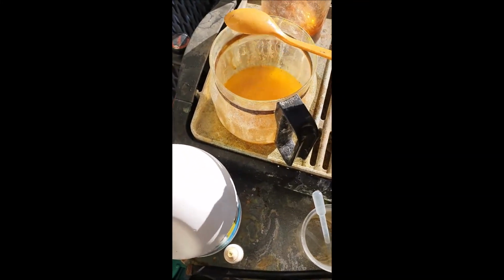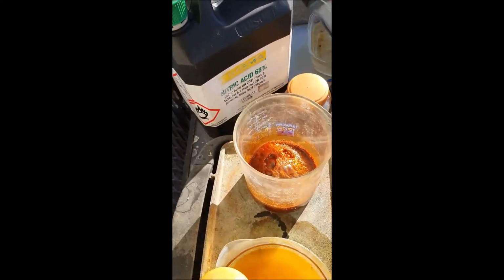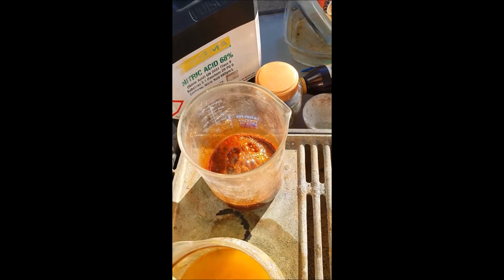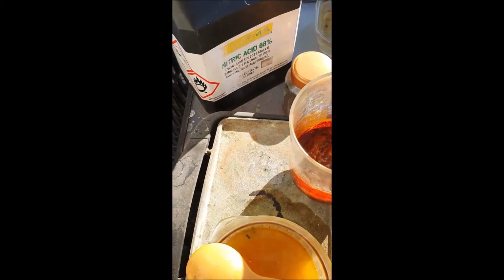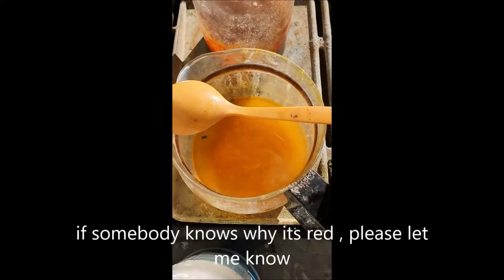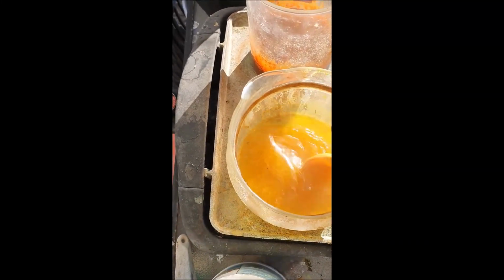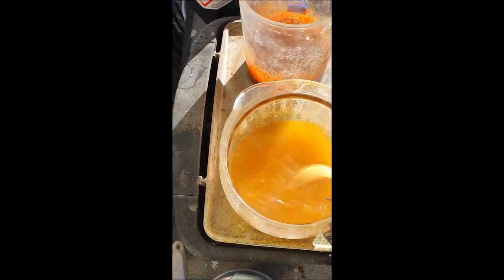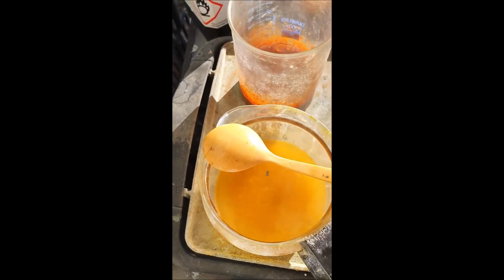So yeah, just let this go for a little bit longer. This one here, I don't know what this is. It's 2 necklaces that I got from a thrift store. I thought they might be gold plated. Put them in some nitric and it's gone red. I'm wondering if it's some sort of palladium or something. I've never seen that colour before. But look at that orange. I love it. You know, when gold chloroauric is yellow, that's nice, but when it's orange, that usually means it's strong. So I'll wash the spoon off and let it cook for a bit.